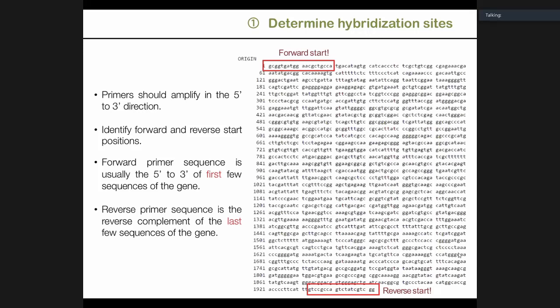Actually, you can do so by doing the PCR individually. Run one reaction with only the forward primer and another reaction with only the reverse primer. Then you have to do genomic sequencing. You cannot combine the amplicons from one to another. Do you get it?